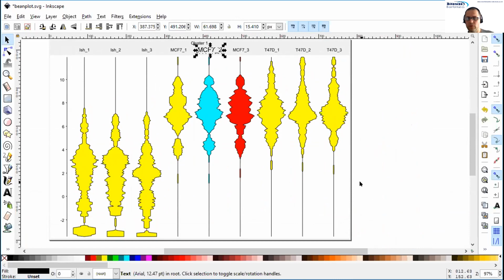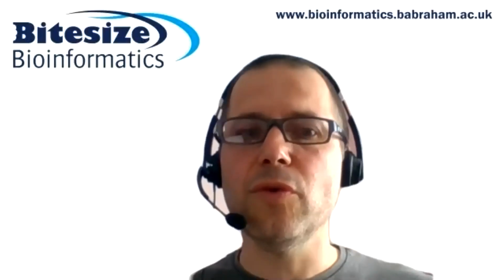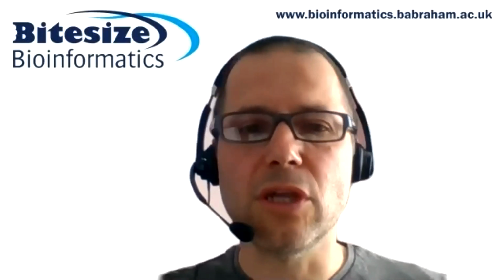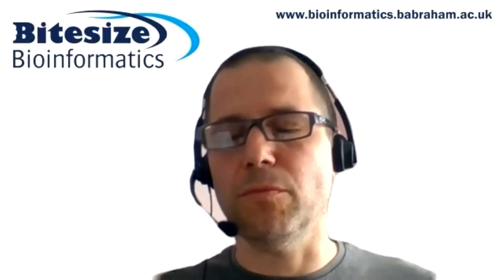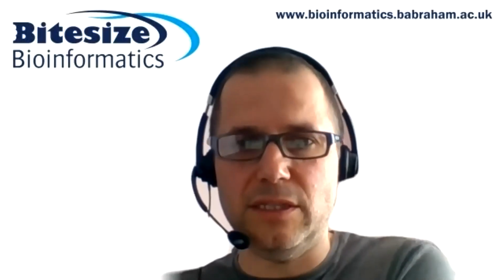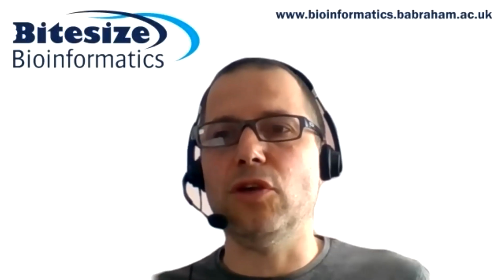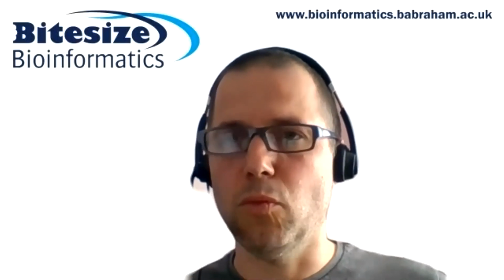Okay, we've gone a little bit over the hour, so I'm going to stop there. Let me turn off the sharing. Obviously, that's a lot of stuff to go through. On our Babraham Bioinformatics web pages, there is a lot of documentation for how to use SeqMonk. We have courses that run on particular data types that will go into more detail, and there'll be more of these events that will go into more detail than we've gone into today. But hopefully this has given you a feel for the sort of things that you can do and the general way that the program works.